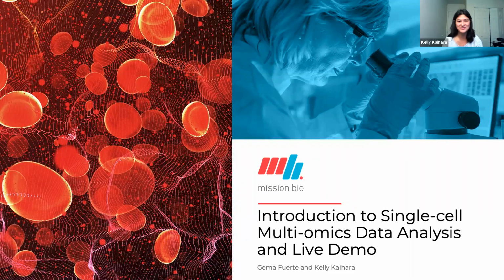The purpose of today's seminar is to show you how to unlock the data and use our software and data analysis tools in order to analyze these very complex multi-omics data sets. We'll do an introduction to data analysis, including a live demo with our Tapestry Insight software. It will be me and Hema for this presentation.